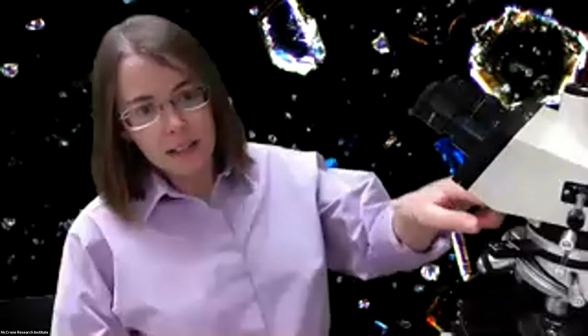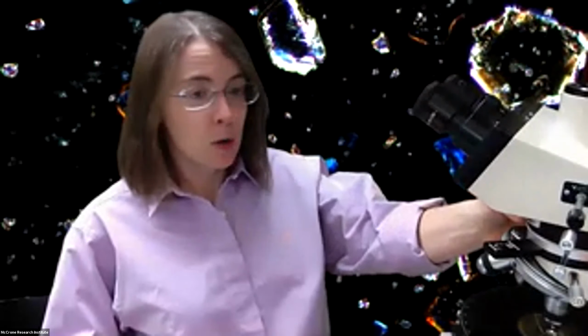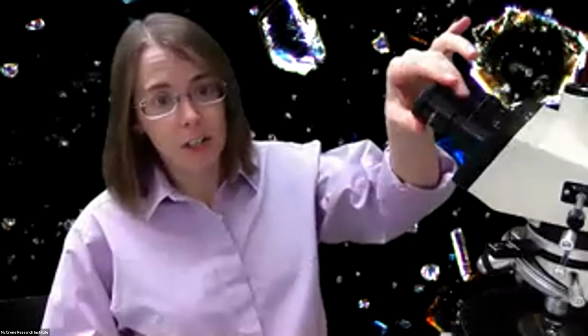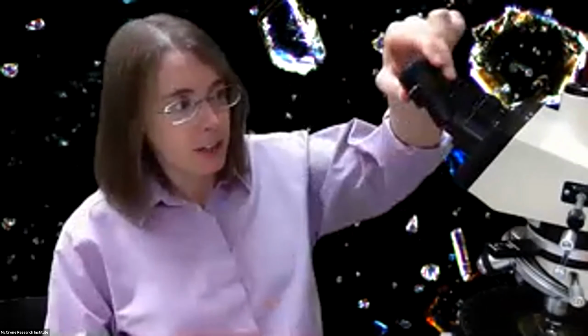Okay, so on my microscope over here, I've got a Bertrand lens, and this Bertrand lens, if I swing that into position, is going to allow us to look at the back focal plane within the light path of our microscope. So I'm going to put that in. If you don't have a Bertrand lens, the alternative is to remove one of these eyepieces and then just look down the eye tube.